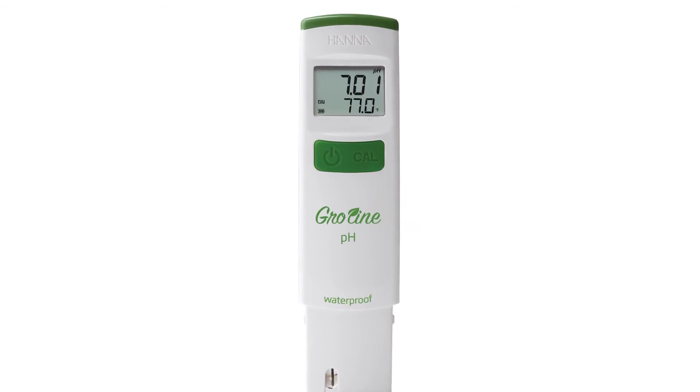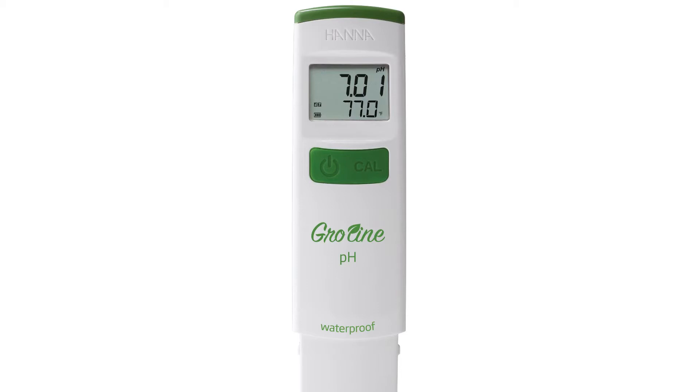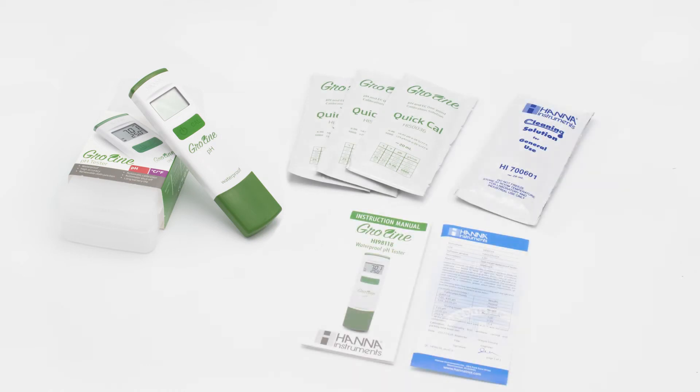All operations are simplified to two buttons: one is for turning the meter on and off, and the other for automatic one-point calibration. Your HI-98118 comes with everything you need to begin testing. Along with the tester comes our Growline Quick Calibration and Cleaning Solution packets, the manual, and quality certificate.